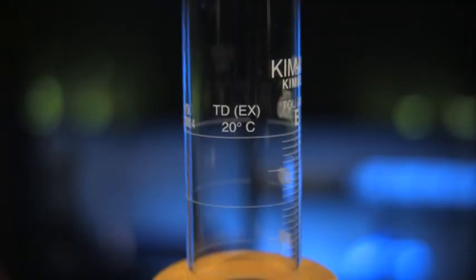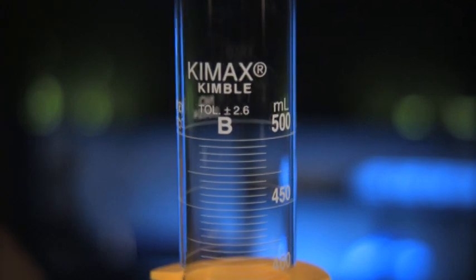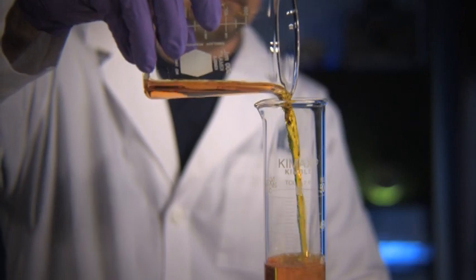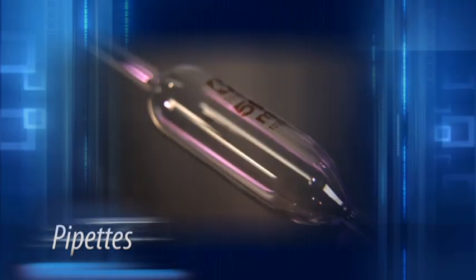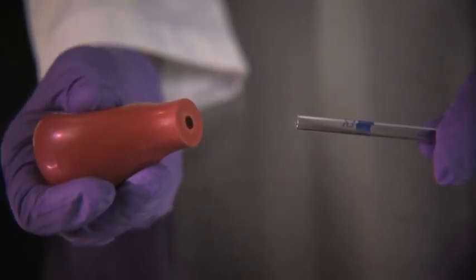The cylindrical shape is more accurate and generally preferred. Graduated cylinders are used to measure and transfer liquids only and are not meant for use over open flames or hot plates. Pipettes are long, thin glass or plastic tubes designed to deliver volumes of usually 50 milliliters or less. A special bulb syringe is required to draw fluid into a pipette.